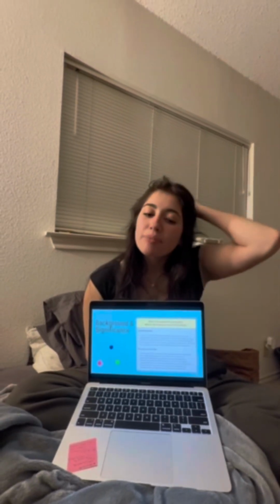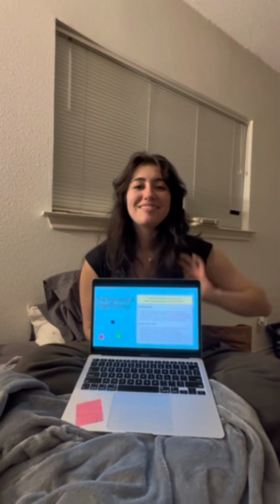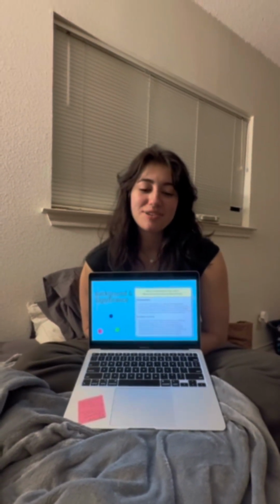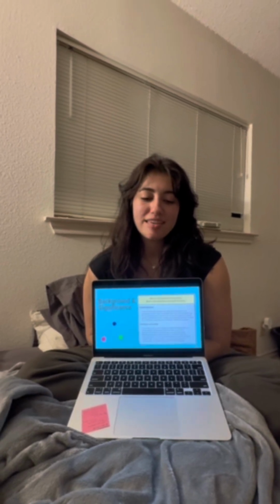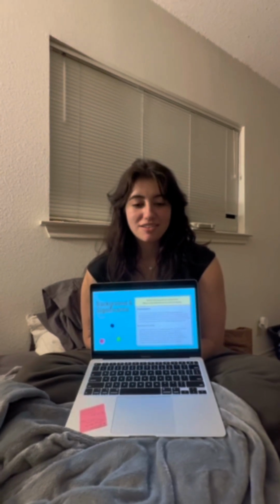The purpose of our study is aiming to boost student engagement by combining DNA analysis and gel electrophoresis into a hands-on experiment. Instead of just analyzing pre-generated images like in our own lab, students will be able to prepare DNA samples and run them through gel electrophoresis and interpret band patterns to identify family relationships. This interactive approach will enhance their understanding of gel electrophoresis and genetic analysis.